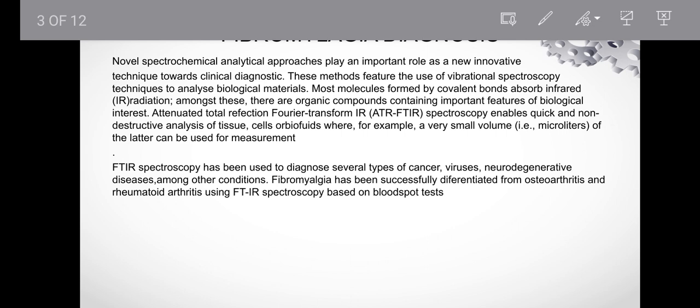A metabolomic fingerprint profile for fibromyalgia and other rheumatoid disorders using IR and Raman spectroscopy, where the spectrochemical signature included all these components, as you see: CH bending in collagen, phospholipids, amide 3, CO linkage, skeletal CO linkage. I'm not reading this line by line. Here they are saying that for every particular organic or inorganic component of the biological fluids, we have a characteristic peak.